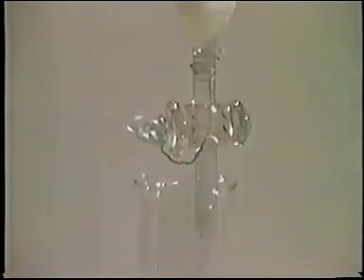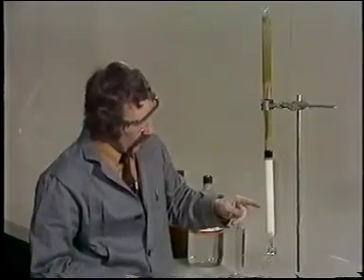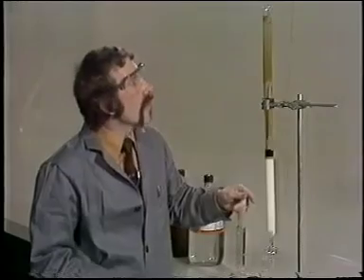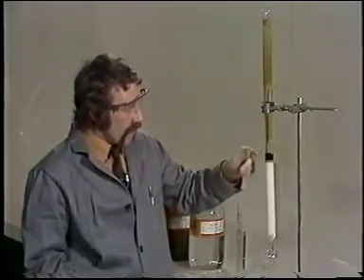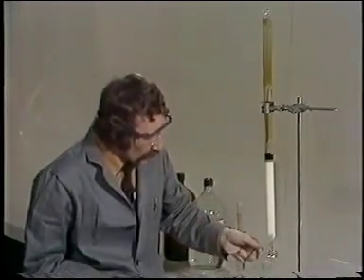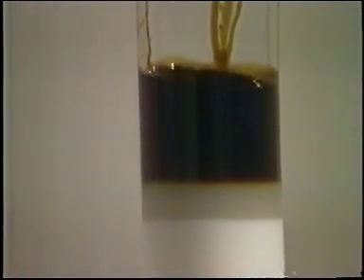The principle is exactly the same, but it's not capillary action, but gravity this time, which causes the solvent to flow through the column. The column is packed with a slurry of alumina, which is poured in and allowed to settle. The solution from the reaction mixture is applied to the top of the column and is run in and absorbed on the top layers of the column by opening the tap.